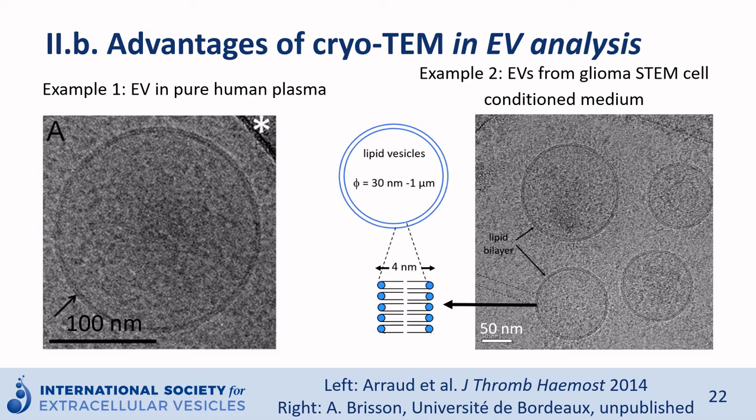This constitutes the absolute proof that these particles are surrounded by a lipid membrane. The resolution of these images is about 1 to 2 nanometers.